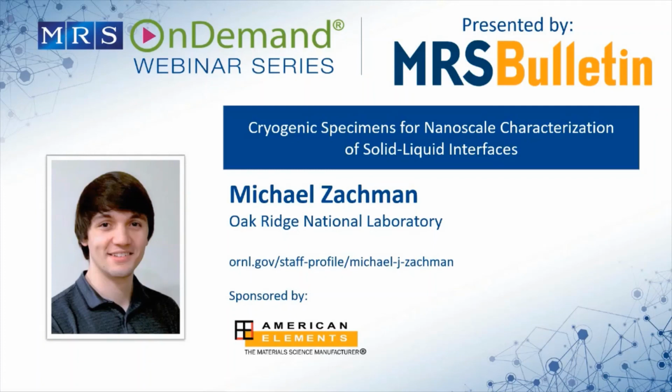On a much more general point, someone's asked, where can folks access cryofib at the moment? I could make a plug for my own facility here at the Ohio State University. We have a cryofib here, and we're a user facility, and people are welcome to approach us. I don't know whether in the national labs and the nano centers there are cryofibs available. Can you or John comment?